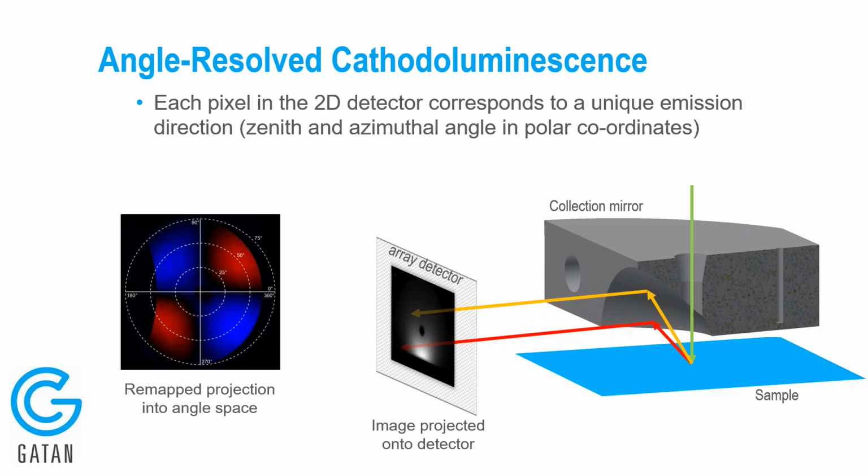As you see here, this is the light emitted from that metallic nanoparticle that I showed earlier in the presentation with the two different polarizations. You can see that we have completely different emission directions depending on the polarization of the light. This is one of the interesting things about this type of work.